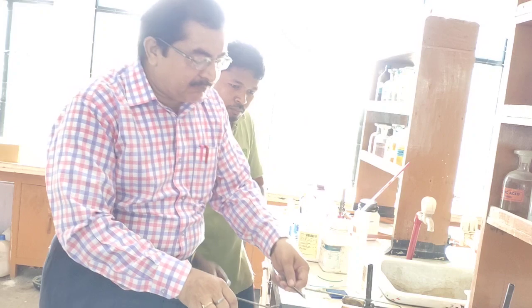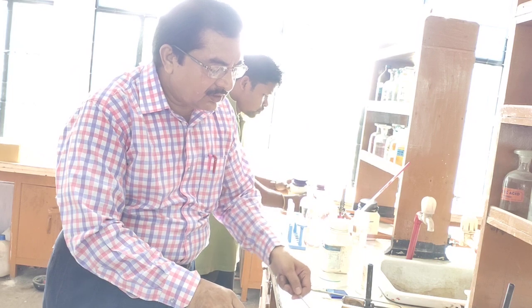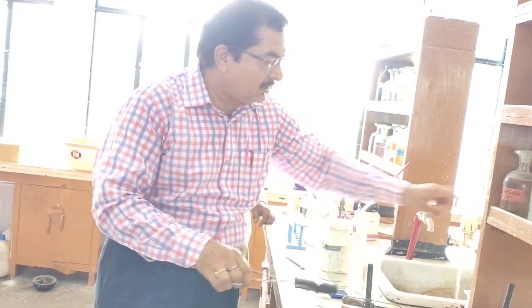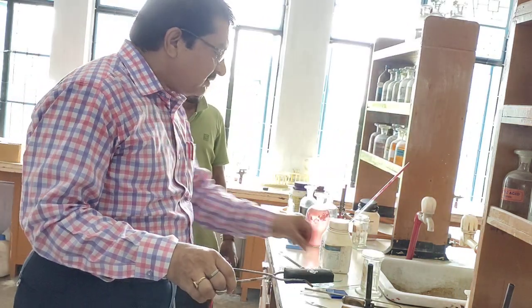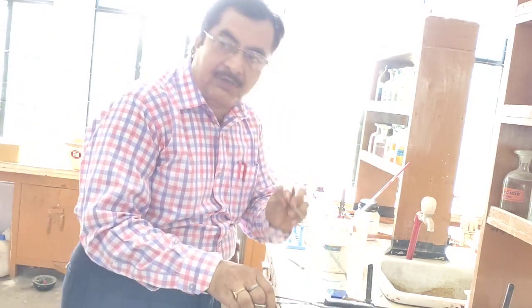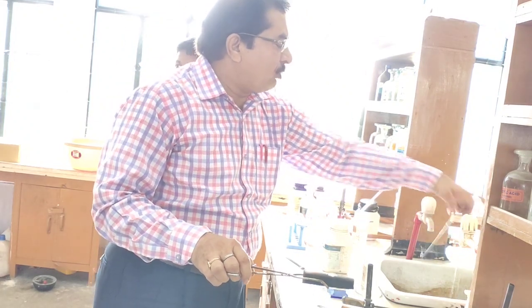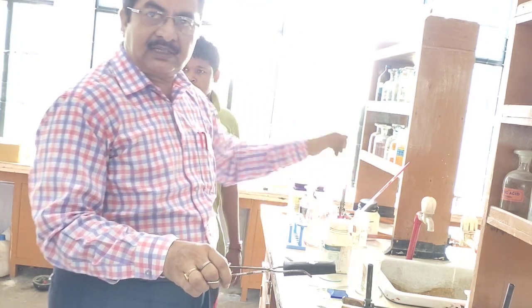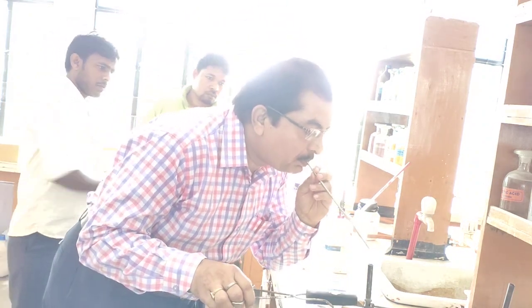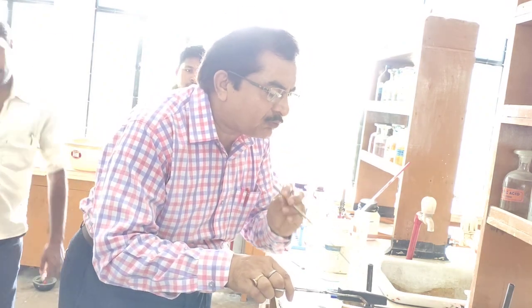Upon mixing nicely, the same mixture we are putting in the cavity of the charcoal block. In this cavity we made here, and then 1 drop of water we are giving, so that at the blowing time it won't be blown away completely. And now our experiment is going to start. See here, this is your blowpipe. Through the blowpipe we will put the flame to the cavity of this charcoal block. Before blowing, please wash the blowpipe. If any impurities are inside, that will be cleaned. And now first of all check whether the flame is coming out or not. Yes. Now we are putting the flame to the cavity of the charcoal.